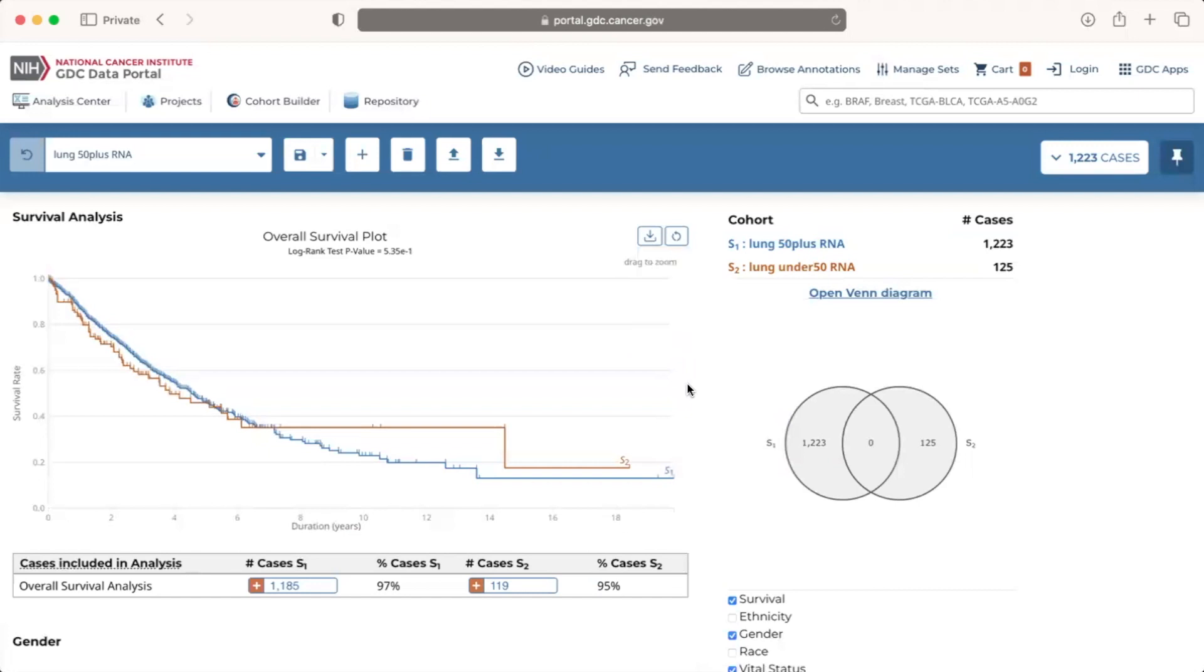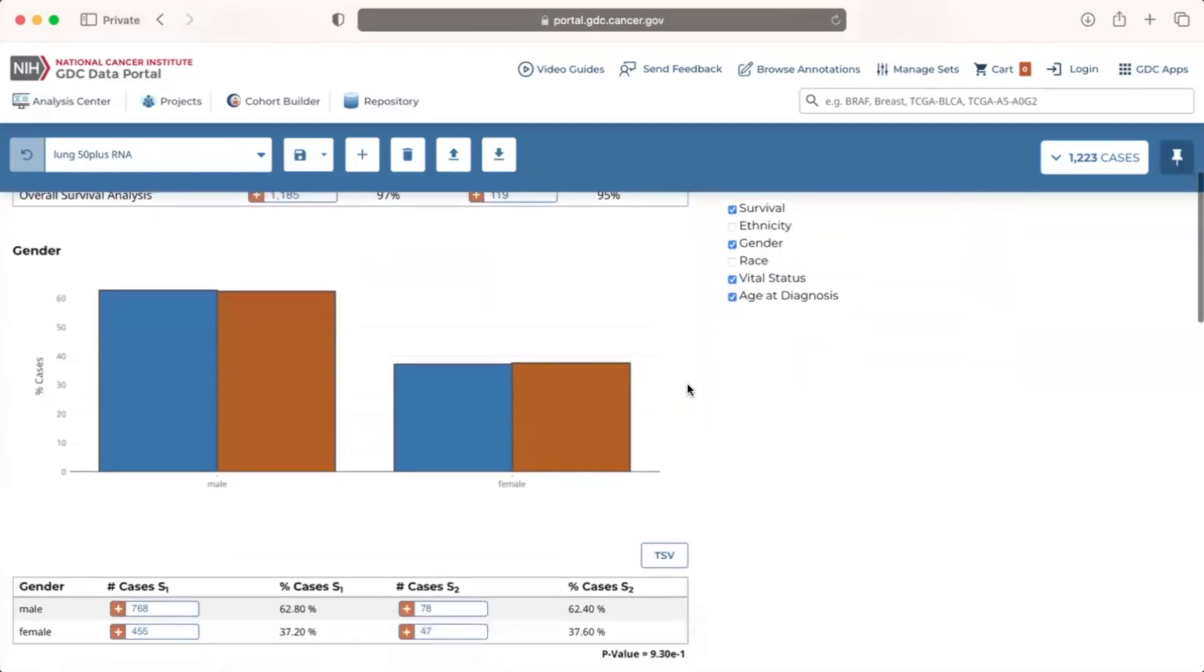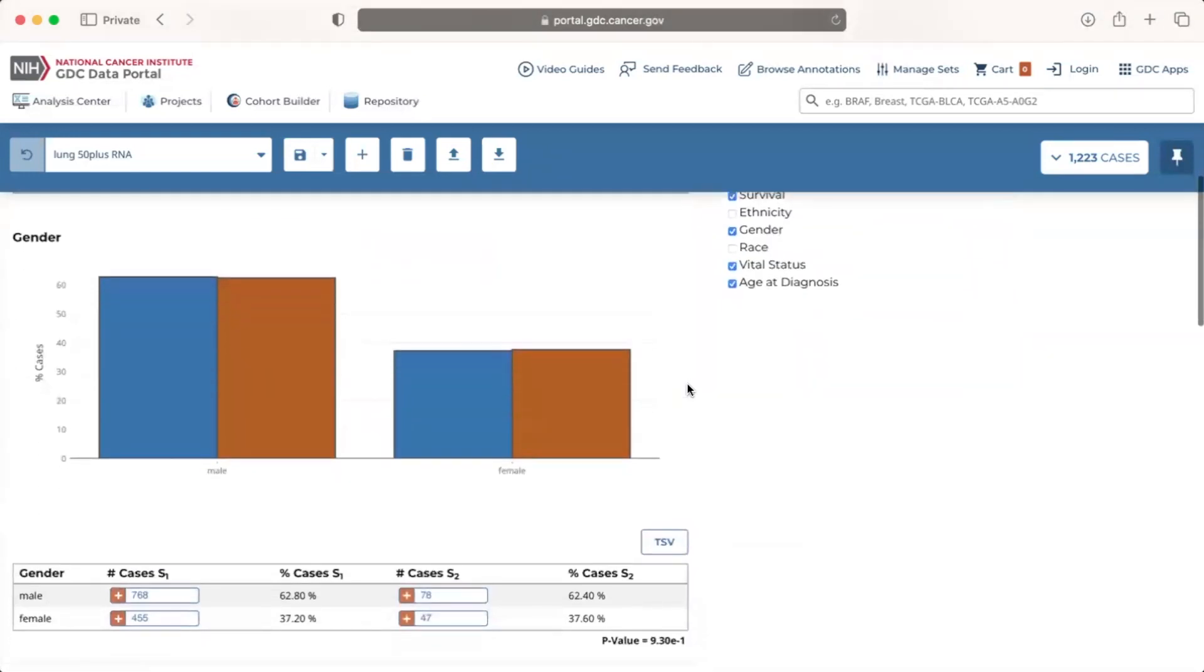Additionally, the bar plots data tables can be downloaded in TSV format by clicking on the buttons labeled TSV directly above and to the right of the tables.